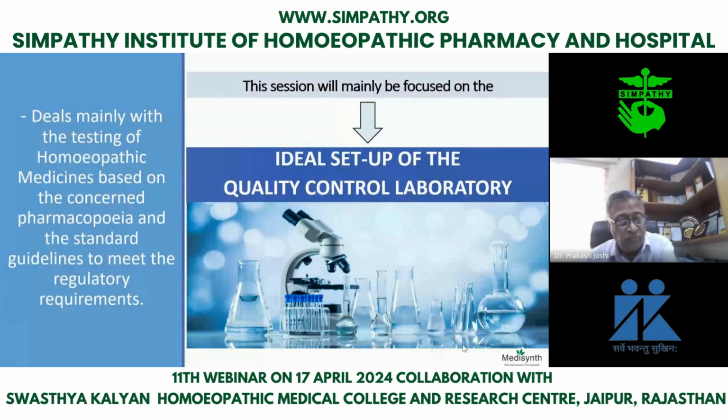And before that, you also know that whenever we prepare any medicine, the basic medicine in homeopathy is mother tincture. The raw material for mother tincture is plant material. If you have to identify plant material in the laboratory, there are many aspects. First is macroscopy, the organoleptic characters, then microscopy, then phytochemical analysis and others. In phytochemical analysis, you come across UV analysis, color reactions, or TLC, thin layer chromatography. So it all depends on what type of laboratory we want.